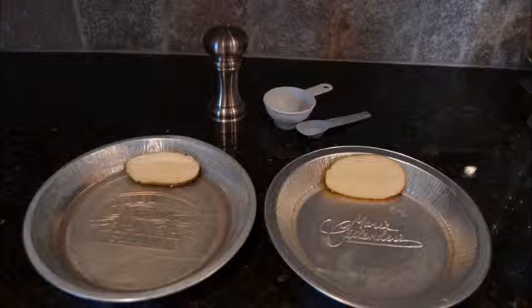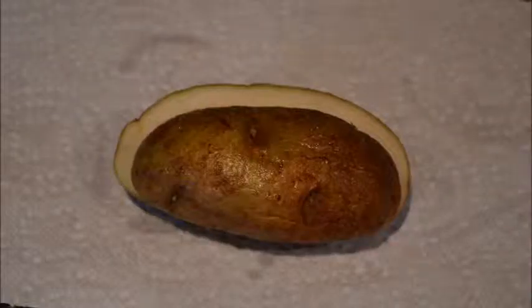The one in the water on the right, with no salt added, looks the same. It is rigid and has good color. The one on the left, in the salt solution, has shrunk and looks wilted. It is visibly smaller in size as the salt has caused water to leave the cells of the potato, thus shrinking the individual size of each cell.